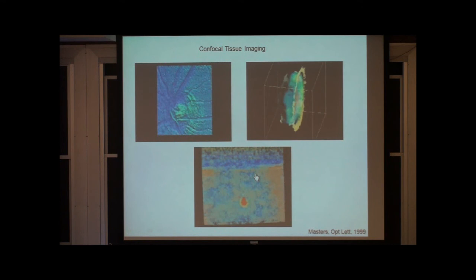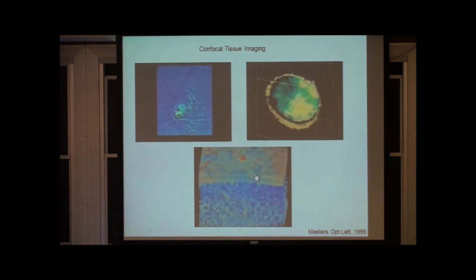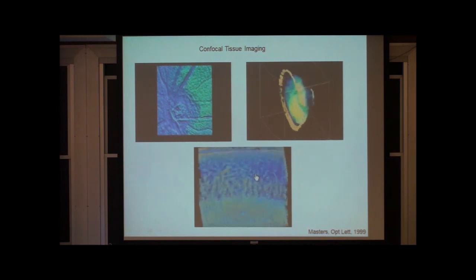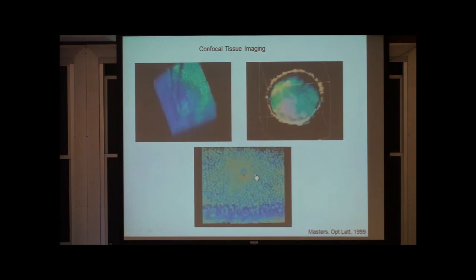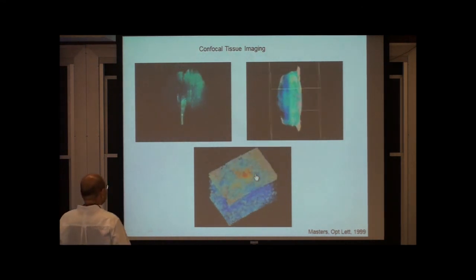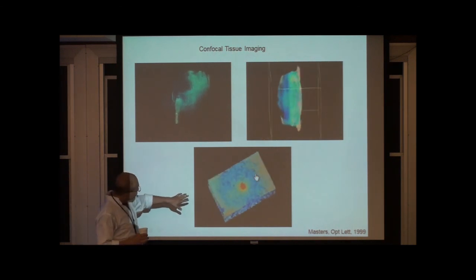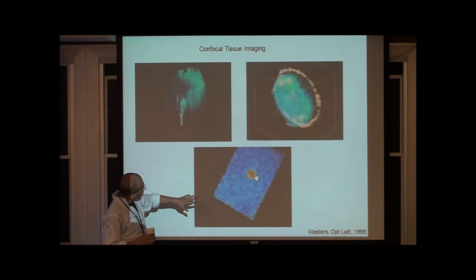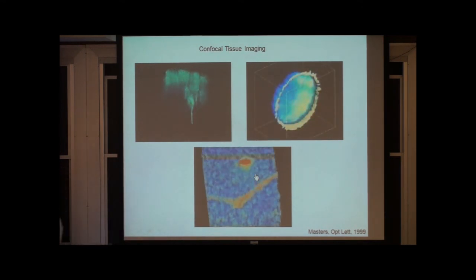So, 1 second, as the image plays through, you can see the individual nuclei there. This is the so-called Bowman membrane, which is the germinative layer on the cornea of the eye. And as you go through, I think I made the movie too long. So here's the optical nerve.